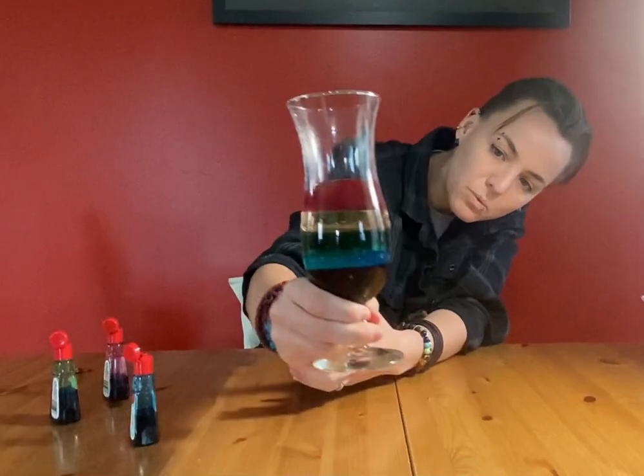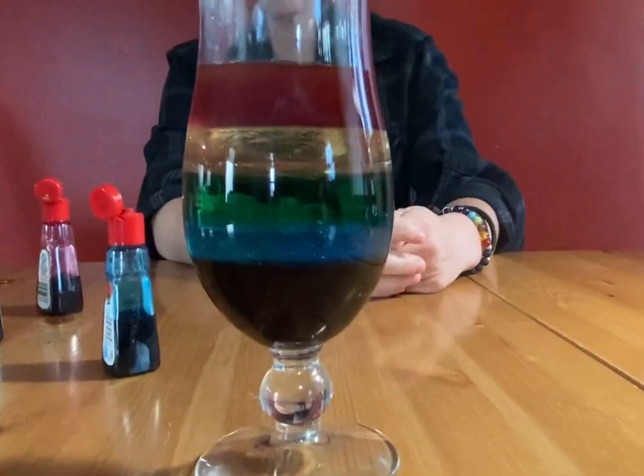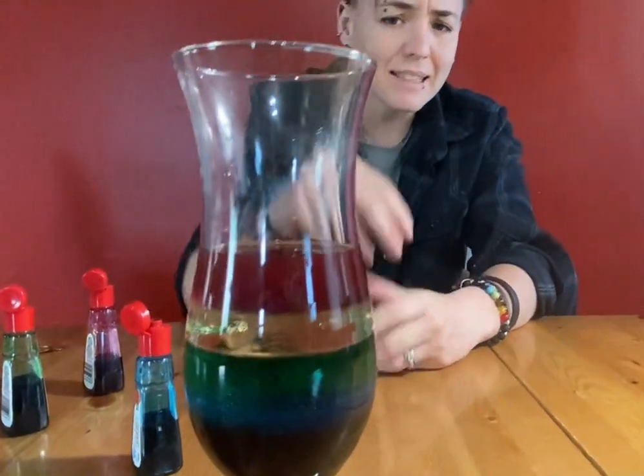So there you go. If you want, you can continue to experiment with this, because I gave you enough to probably make 2 liquid rainbows like this.